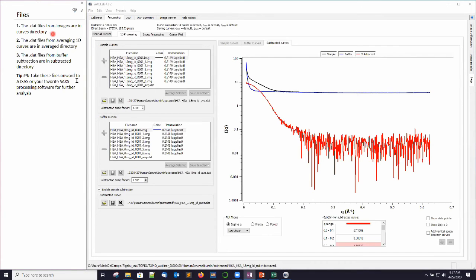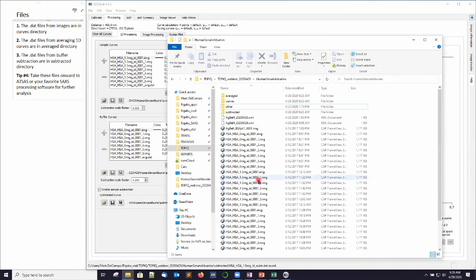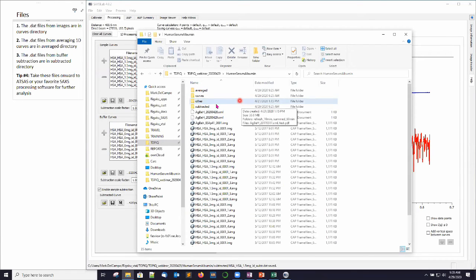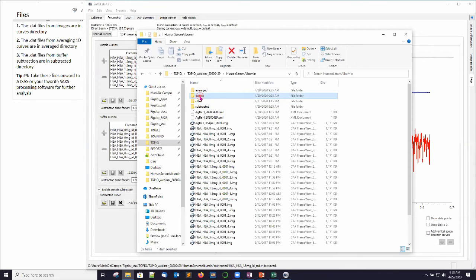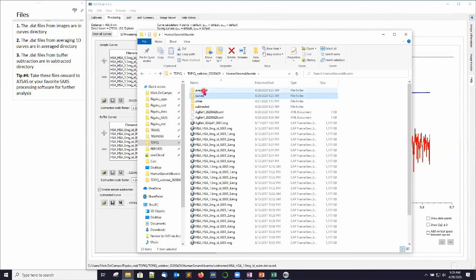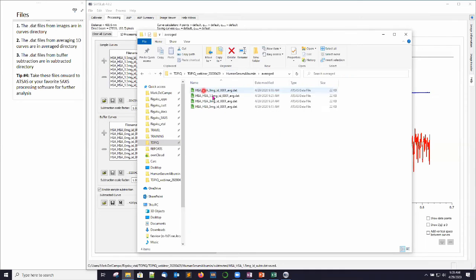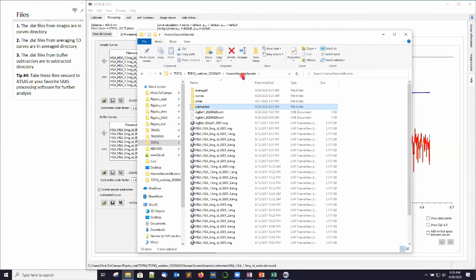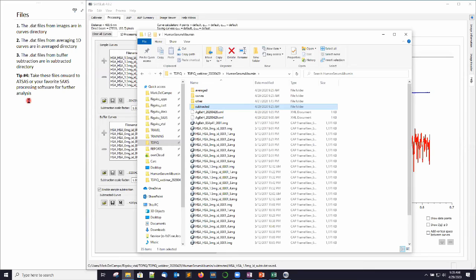So files. Let's talk about files. If I go out to the directory tree here, you can see I have all of my images. And every time we press the save button, we generated a new directory that has dat files in it. So this curves directory inside has a single dot dat file for every image. The averaged directory has a dot avg or an averaged data file for everything that we averaged. And the subtracted directory has our three subtracted dot dat files. So all of that stuff is right there on the disk. And you can take these files onward. In my tip number four, you can take it onward to your favorite SAXS processing software. A lot of people are using ATSAS. So that's what you can do at this point. And that is where the standard set of processing capability of SAXSLab would normally end.